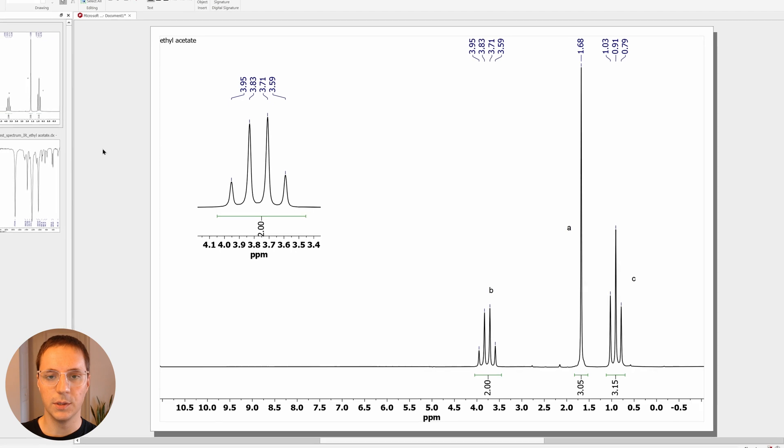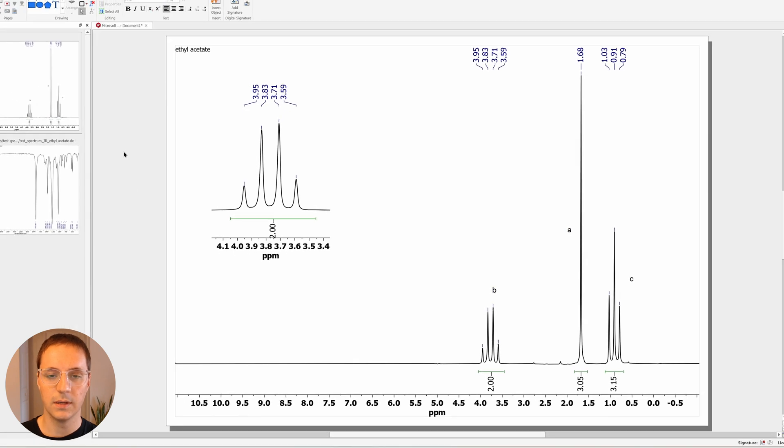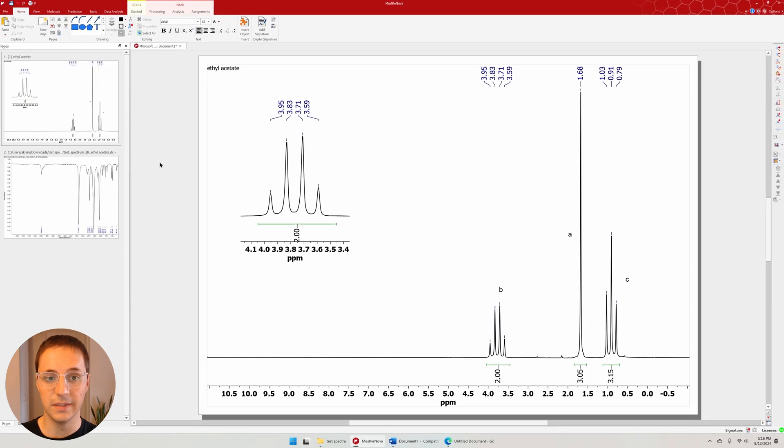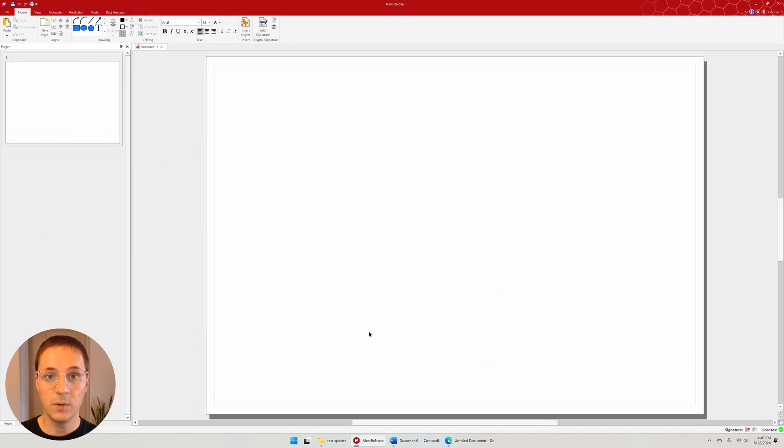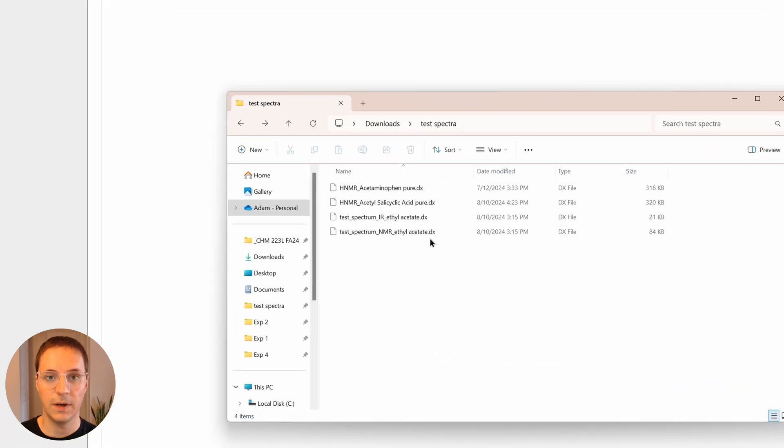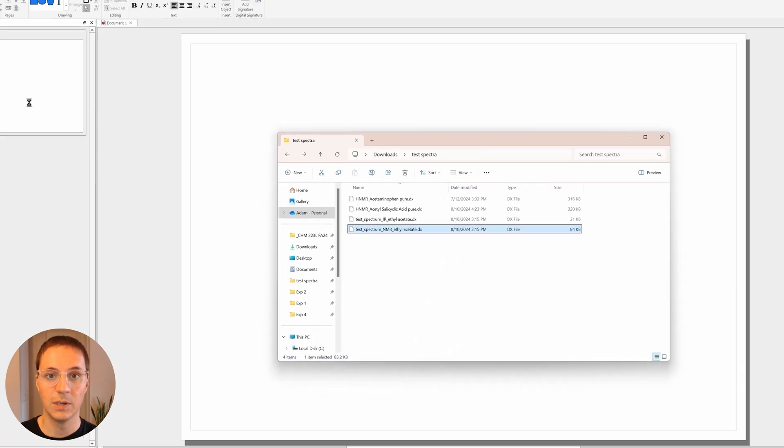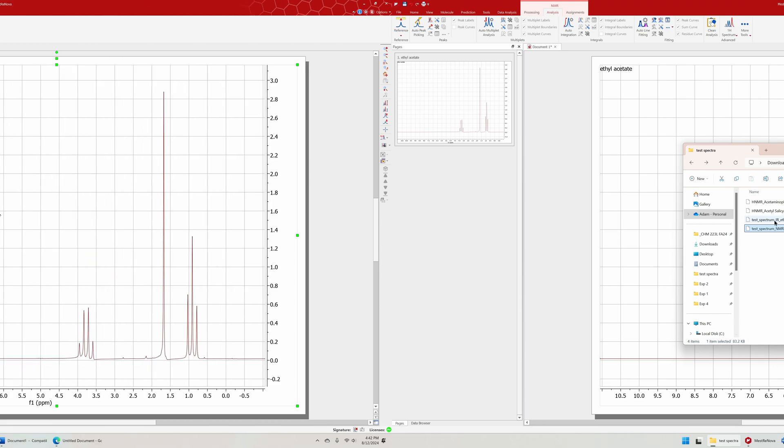This video will show you how to produce nice looking NMR spectra like these. To open a spectrum in Mestronova, drag and drop the DX file from your file explorer into Mestronova.